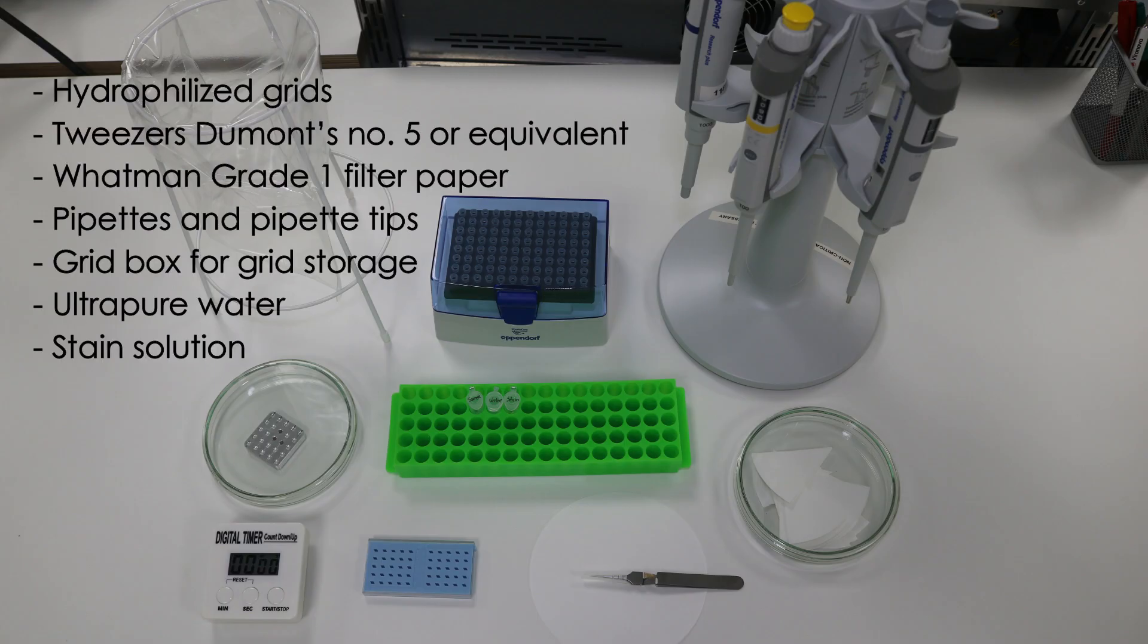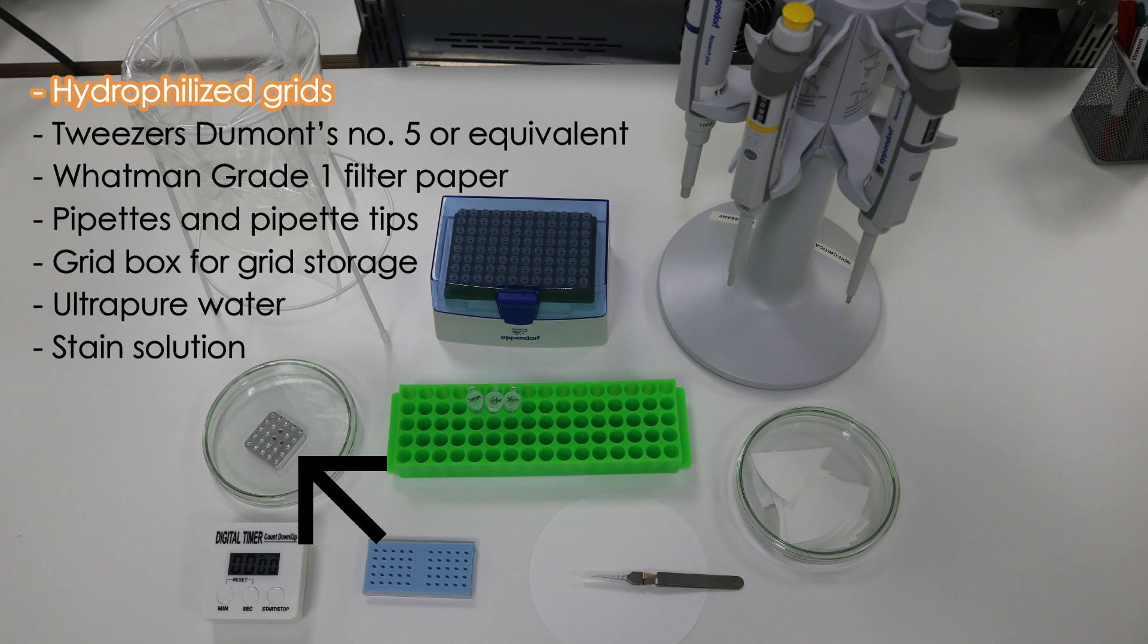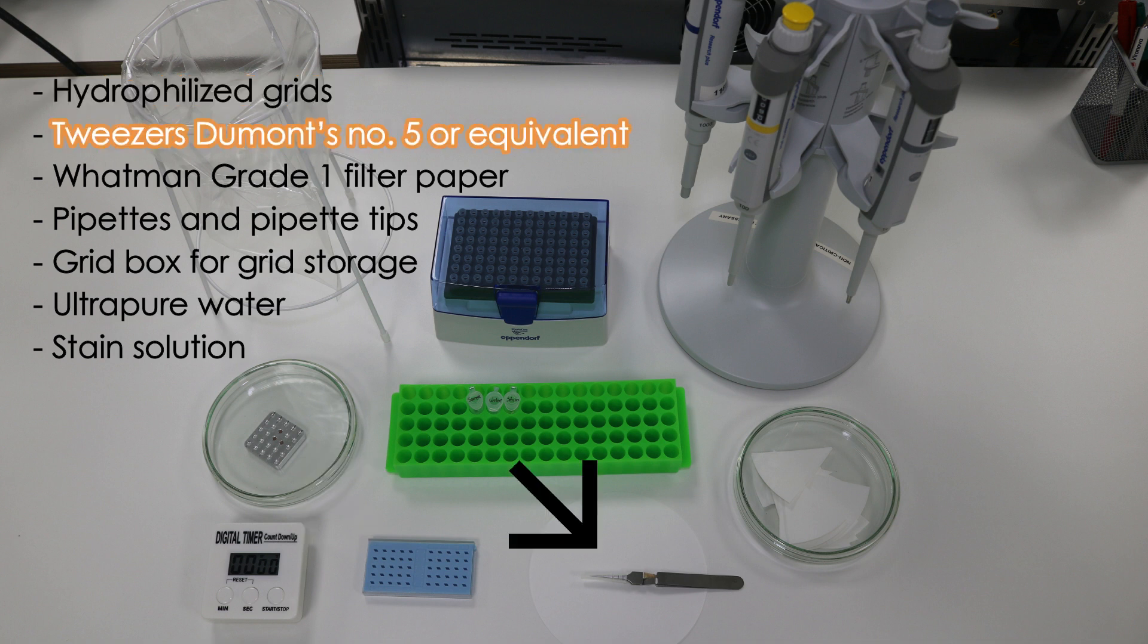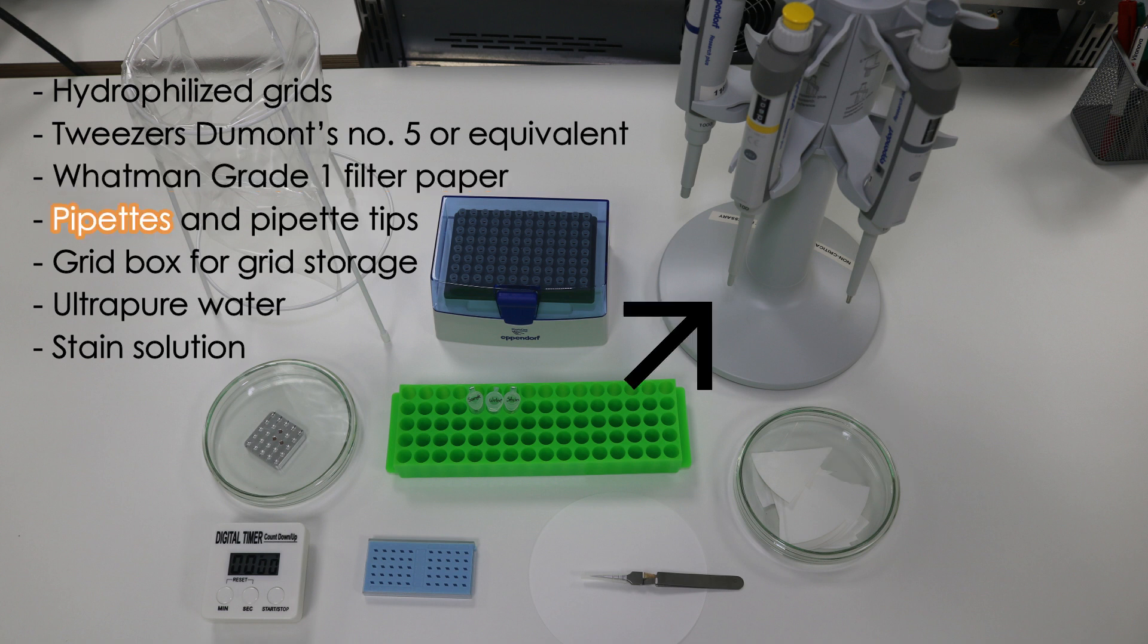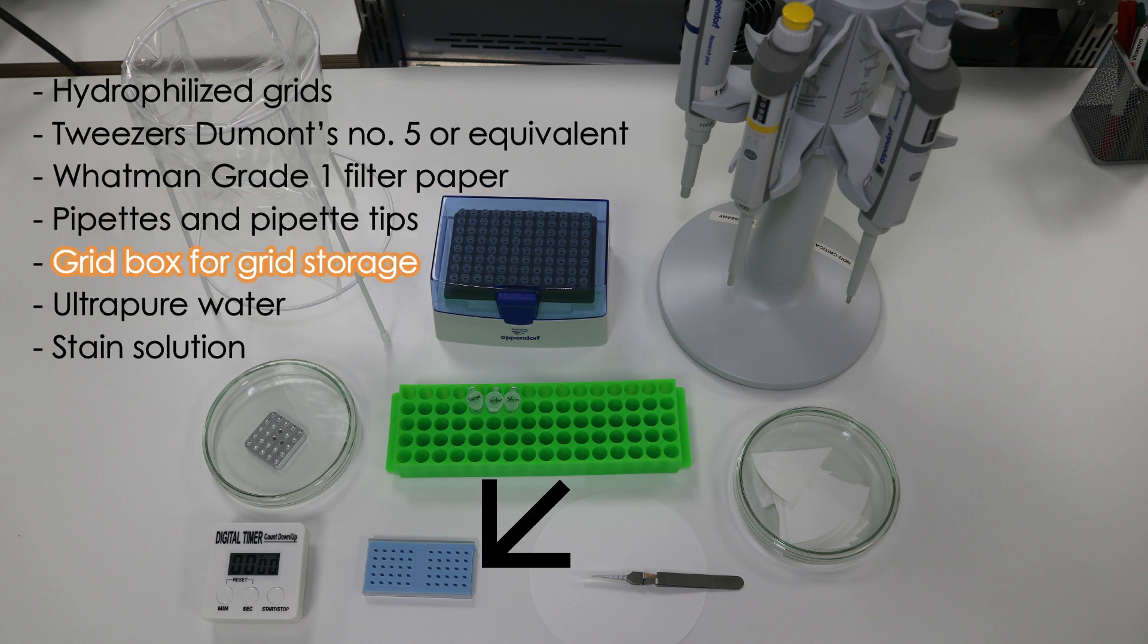Before you begin, gather the materials you need which are pictured and listed. If your grid is not hydrophilized, see the video on sample preparation grid glow discharge.